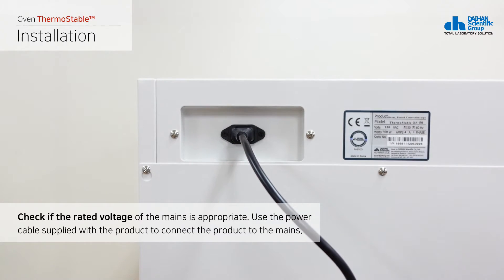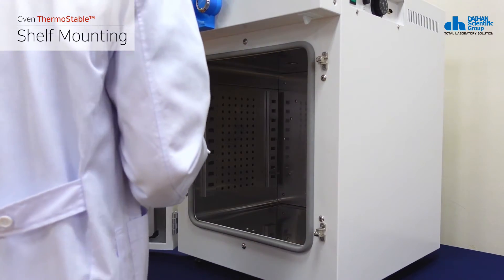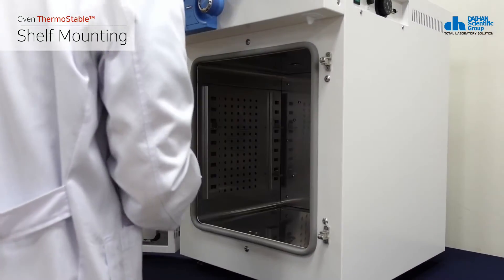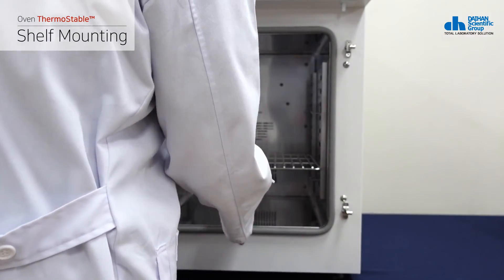Use the power cable supplied with the product to connect the product to the mains. Next, mount the shelves. Hang each shelf hook on the groove inside the chamber at the desired height, then place each wire shelf on a pair of shelf hooks.